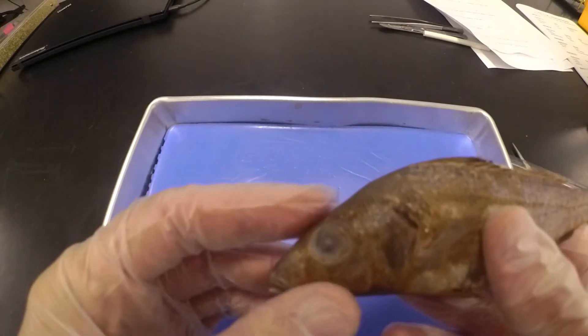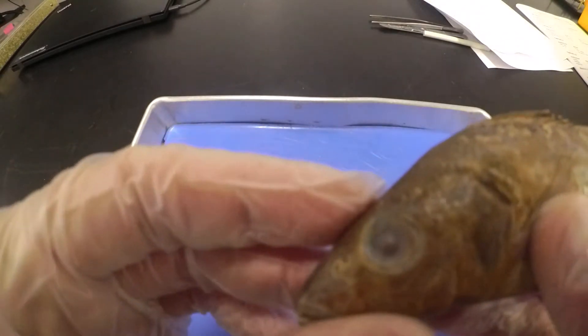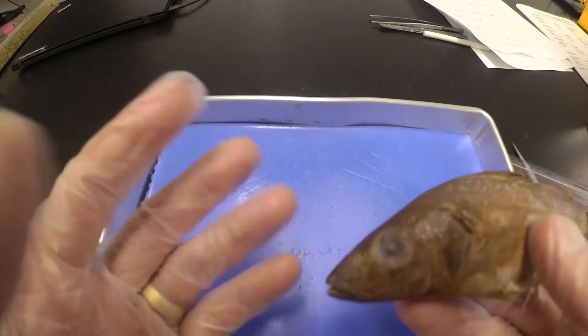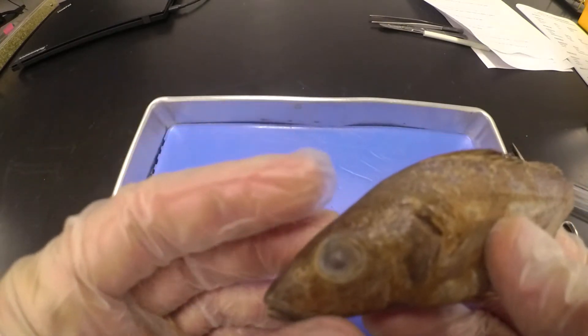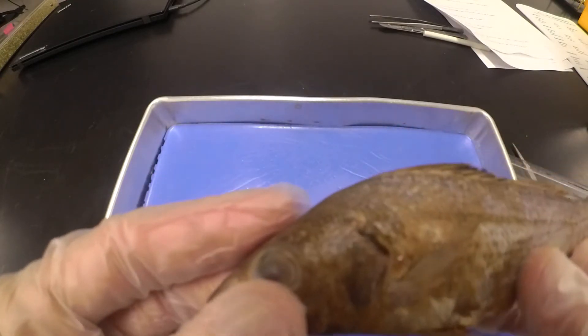Next we're looking at the eyes. When you look at the eye, it's got no eyelids on it — it's always in water. The purpose of your eyelids is to keep your eyes moist, so since they're always in the water, they don't need eyelids. Eyelids are not something you're going to see on most fish.